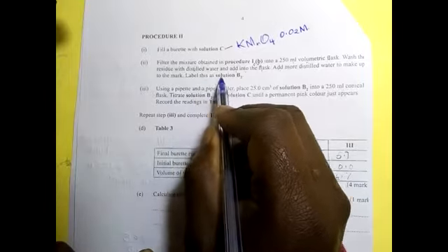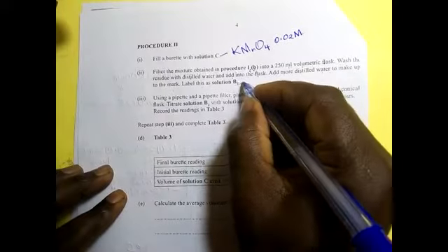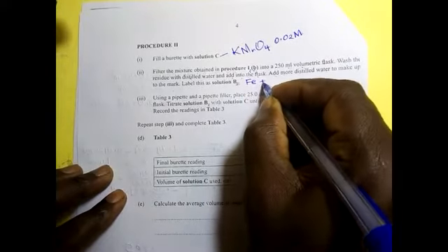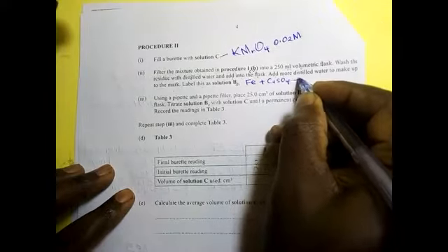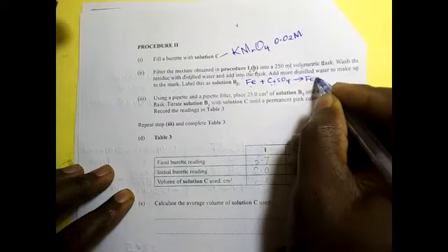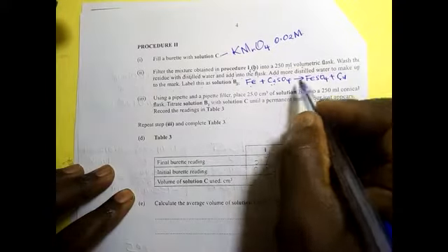Label this solution B2. So here you need to understand that B2 was iron. Iron will react with copper 2 sulfate, whereby iron is more reactive than copper, therefore it will displace copper to form iron 2 sulfate plus copper. Copper will be displaced.